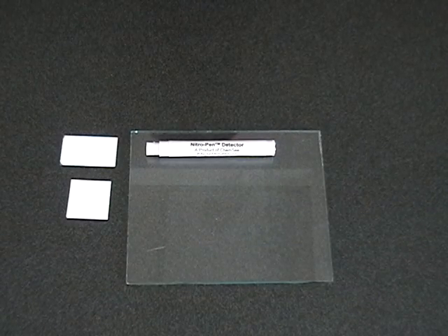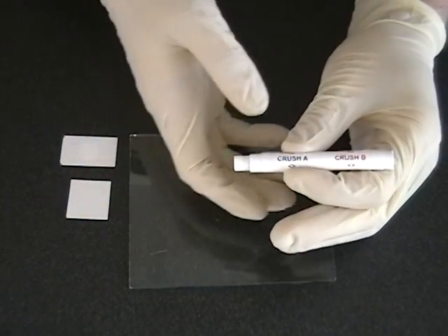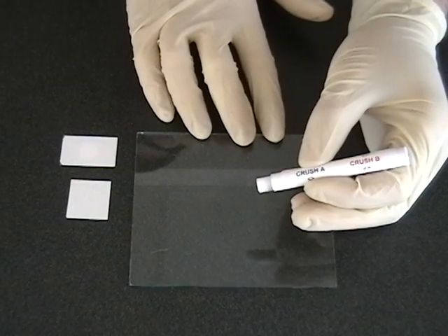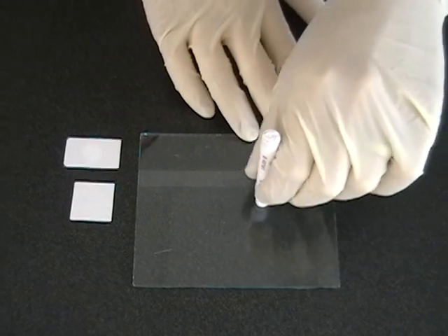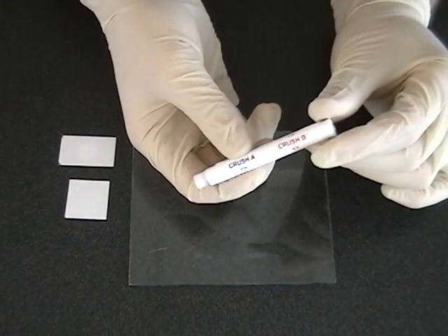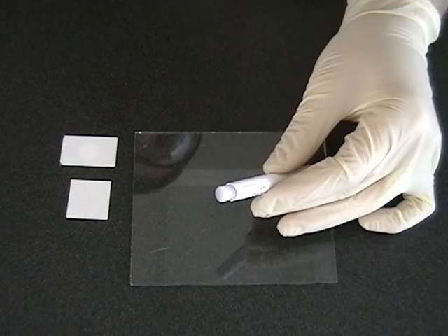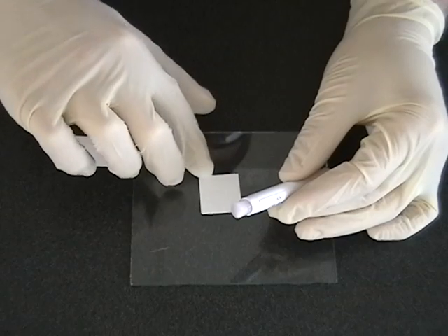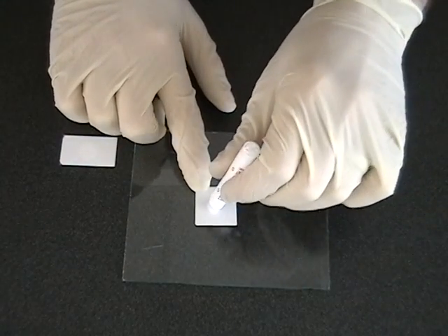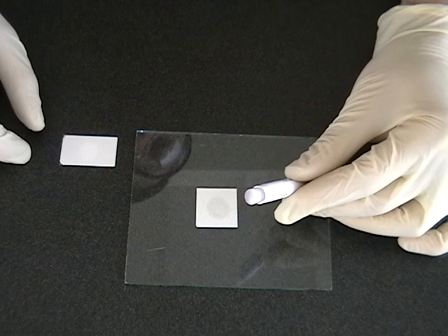The nitro pen 03 and nitro pen 04 models have validation tabs available, which ensure that the detector is functioning properly. These tabs should only be used after all the previous steps, and only if no explosives were detected. Proceed as before, first breaking ampule A, wiping the suspect surface, and waiting 30 seconds for a color to develop. Next, break ampule B, allowing the solution to mix with the ampule A solution on the swab. Wait 30 seconds. Since no color has developed, we can proceed with the detection of inorganic nitrates, if available. If the Z-pad is going to be used, press the swab firmly on the Z-pad for 15 seconds. Since no color has developed for any step, we can proceed with the validation step.